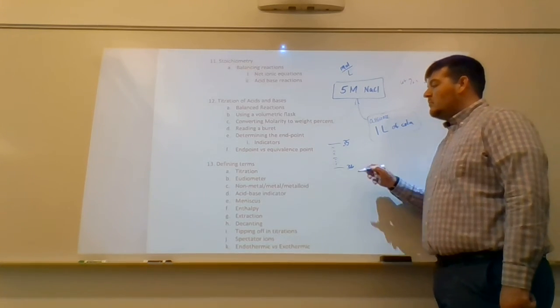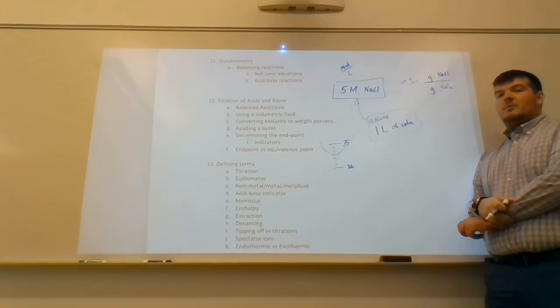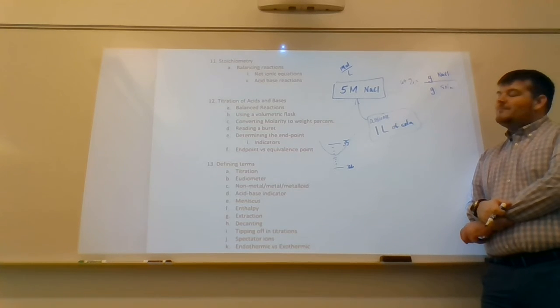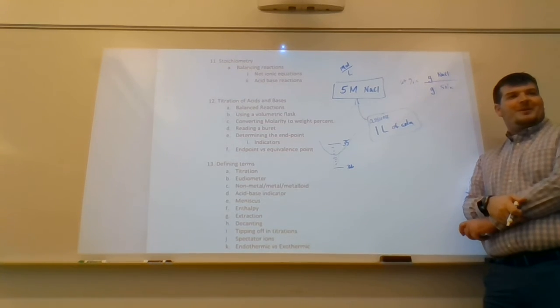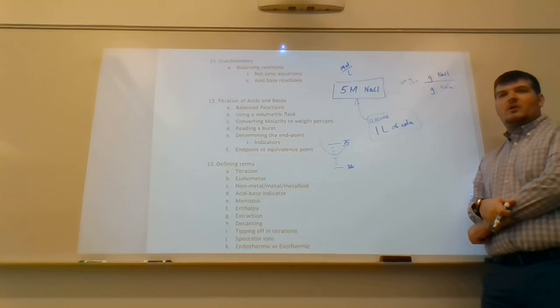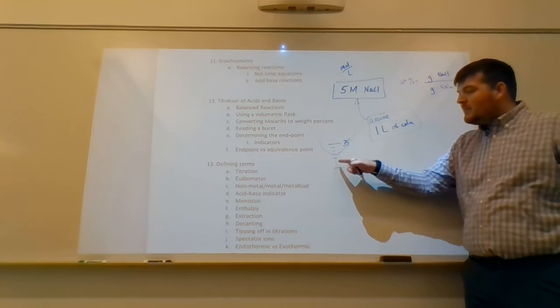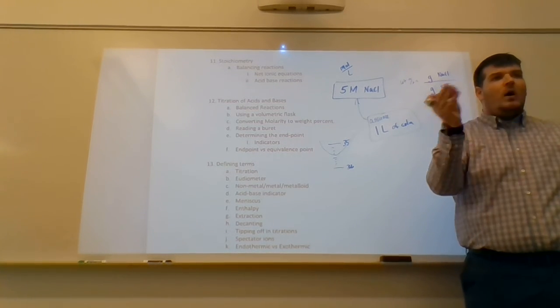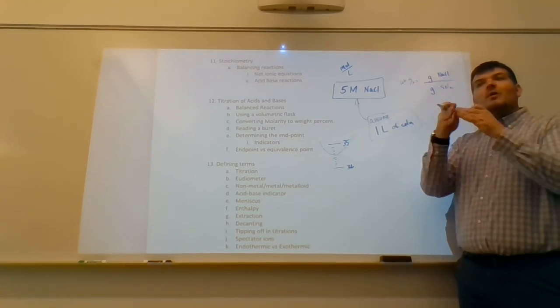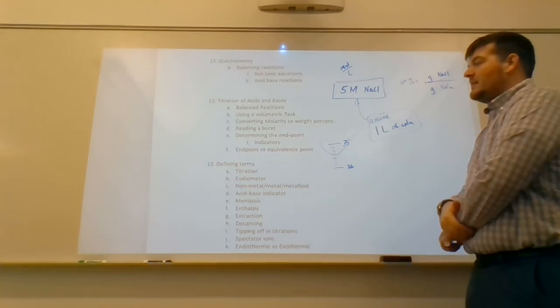So what happens if I have my line right there? That would be what? I know my lines are all over the place, so I'm cool with whatever. 35.4 something. In this case, I'd say 35.41, 35.42, whatever you want to call it. Be mindful that because the tick marks are at every 0.1, the tenths place, the estimated value would be 1 after that, the hundredths place. Make sure you read to the correct number of significant figures.